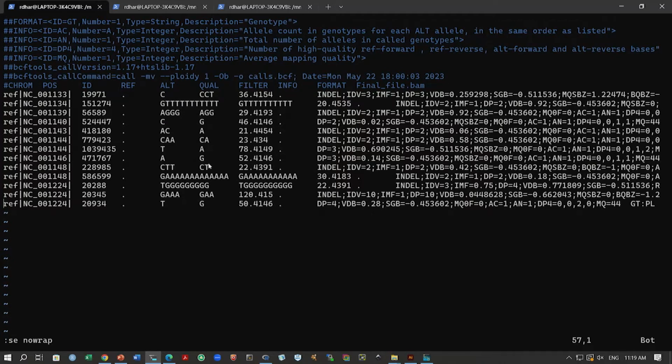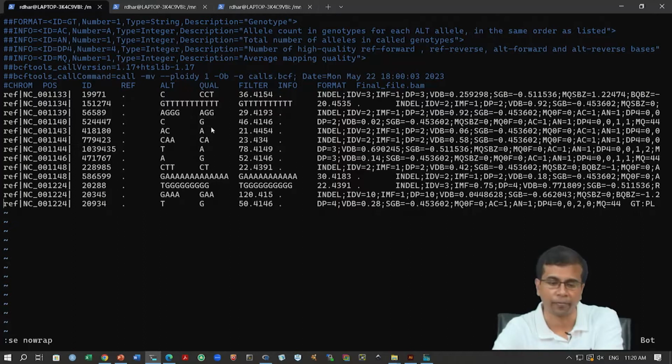You have all these interesting variants around here, and there are a lot of indels, and then there are some SNVs. You can see these SNVs here, T2A or A2G, and again their positions and the chromosome are given. What we will do now is go to the integrated genome browser and open up this alignment, and see whether we can actually see this variant, and whether it is an artifact of alignment or not.